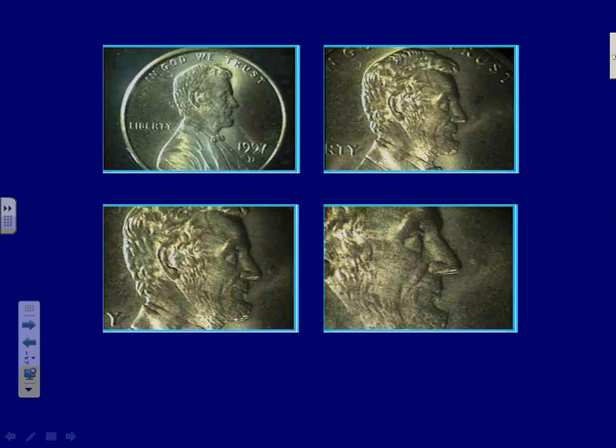Yep, the top left. It's got the lowest magnification. This is low, right? And which one is the highest power magnification? Yep, bottom right. This one is high, all right? Now, when we zoom in from low to high, and that's essentially what we're doing, you can think of it like on your phones these days, how you pinch and zoom into something. So when we're switching to low, medium, and high, it's like we're zooming in on that object.